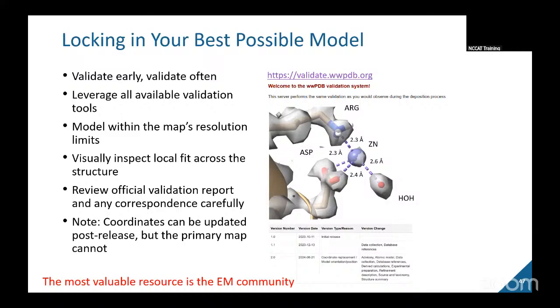This point was raised earlier, and it's hard to achieve, but do everything possible to work with the best quality map you can produce, and then model only to the level of detail that the resolution truly supports. It can be tempting to push limits, but restraint is key to accuracy. You don't want to overfit and say more than what your data can actually support.